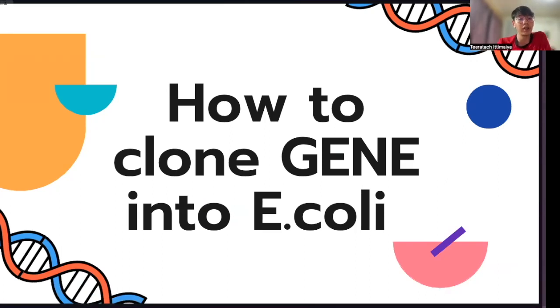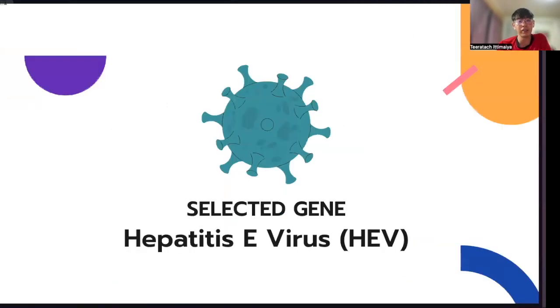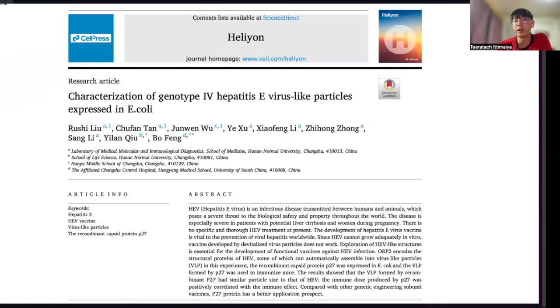In this presentation, we present how to clone a selected gene into E. coli cells step by step. In our presentation, we will try to clone hepatitis E virus, or HEV, gene into E. coli and get them to express virus-like particles for HEV vaccine development. Our work is mainly inspired by this article in which they try to express HEV virus-like particles from E. coli cells.